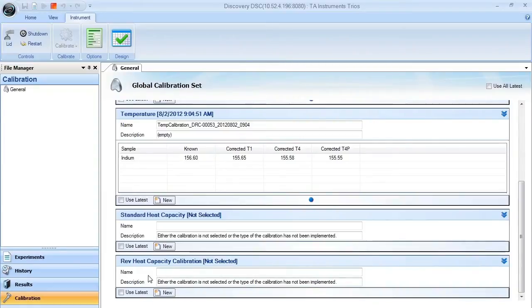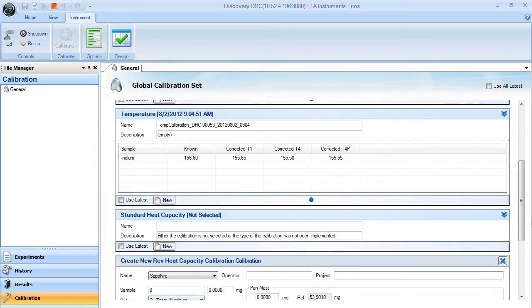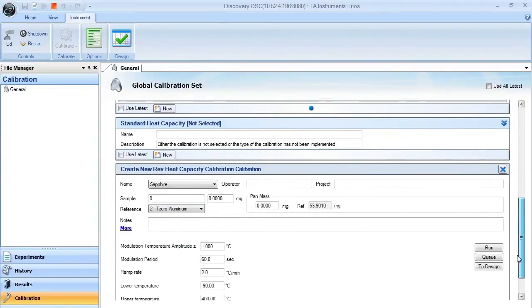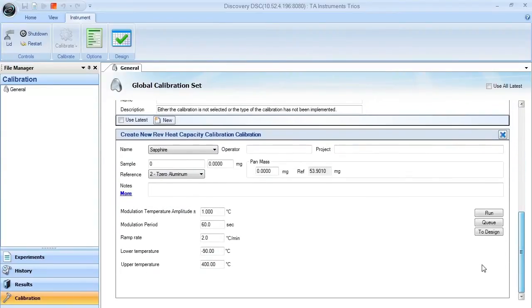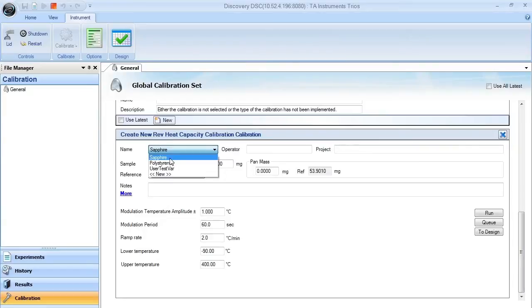When you want to select a new calibration, select new. You'll be prompted to select a particular calibration material. In this case, we're going to choose sapphire.